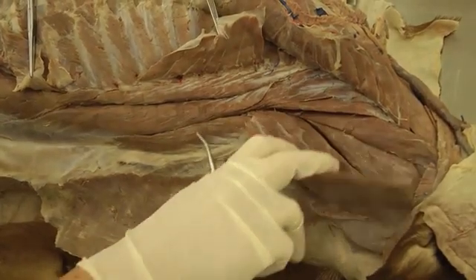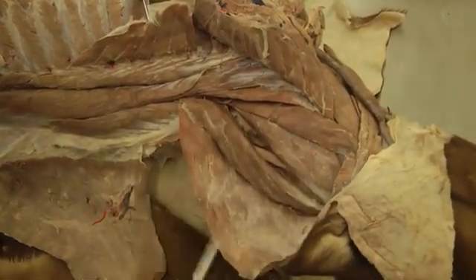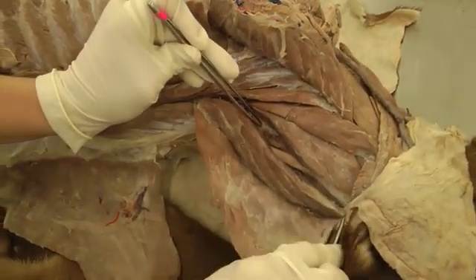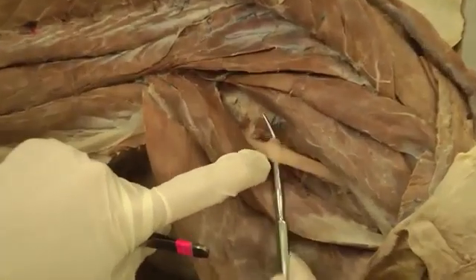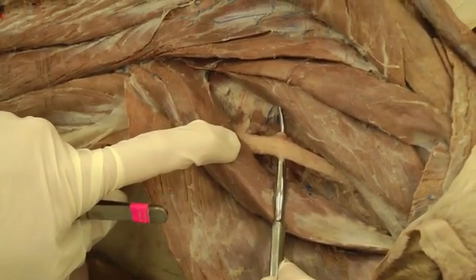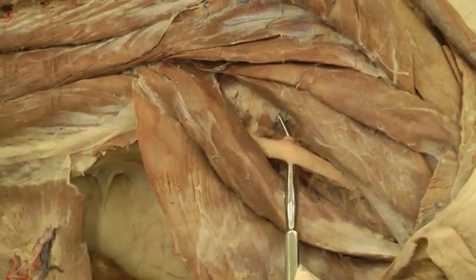In the dog, you'll part the biventer and complexus — just find the seam between them and split them apart. You're looking for the nuchal ligament, which is this white elastic tissue right here. The cat does not have one, so don't look for it in the cat. But in the dog you'll want to find the nuchal ligament.